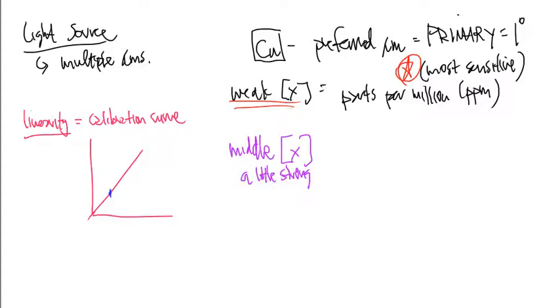So if I'm giving it a 10 part per million or 20 part per million, it can't distinguish the difference between a 20 ppm and a 22 ppm. And it begins to get some problems. And that's what we call the linearity range. Well, these problems will start to make my linear curve non-linear, and it will start to bend. And I don't need that to happen in a laboratory, maybe.